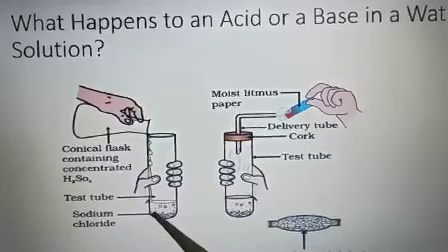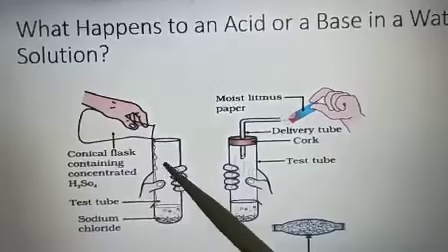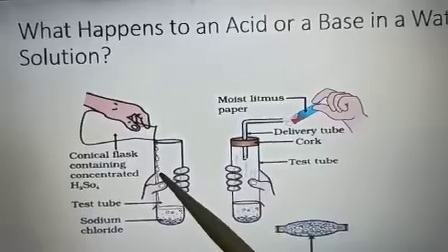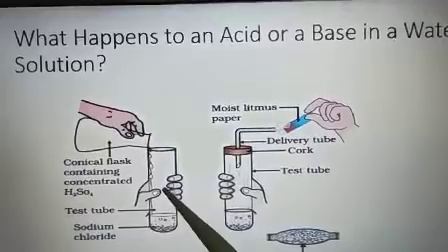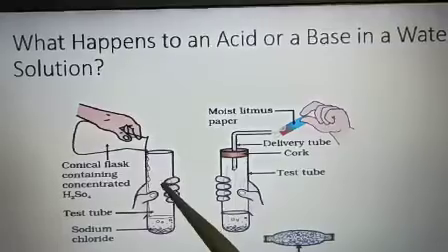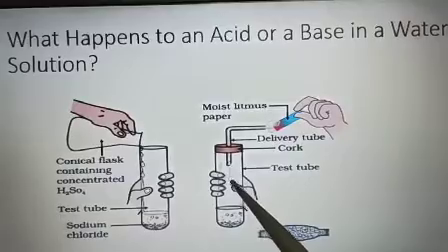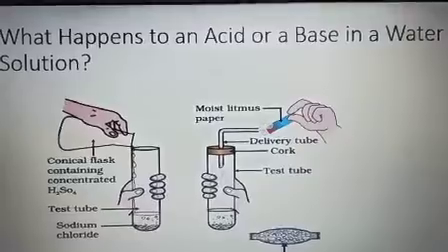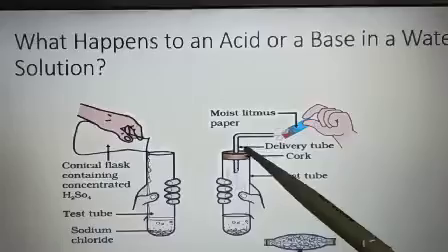And we are taking a small amount of sodium chloride, that is NaCl, and then we are pouring some concentrated sulfuric acid, right? Means there is no water added in the test tube. Afterward the reaction takes place, and there will be an evolution of a gas. You can see here, the gas is evolving in the test tube, right? And this delivery tube is attached with the help of the cork in the test tube, and through this delivery tube the gas is coming out.